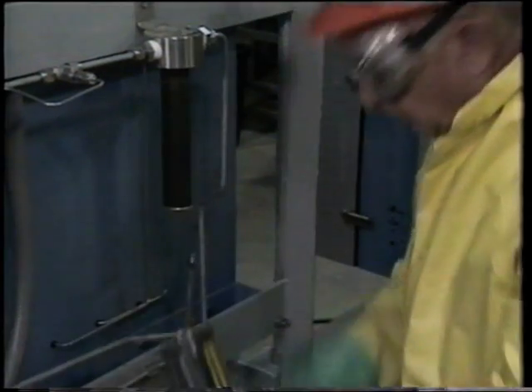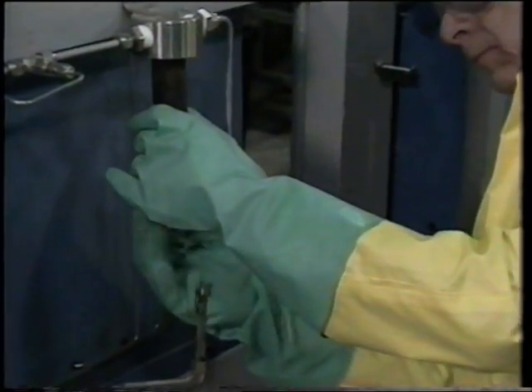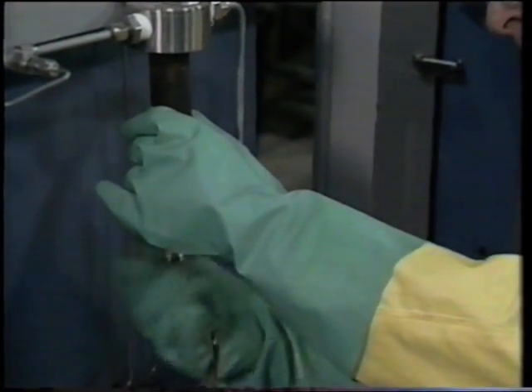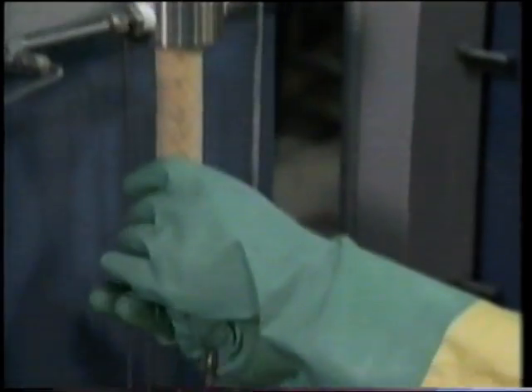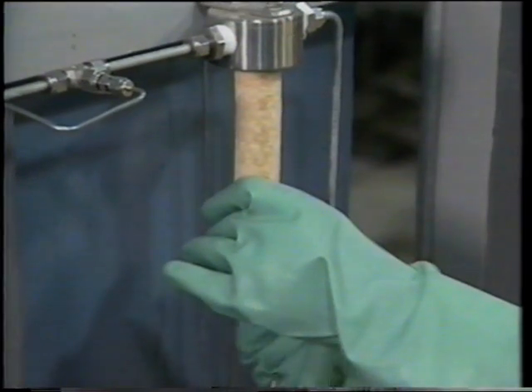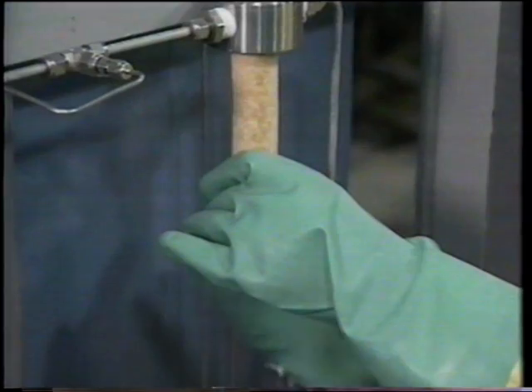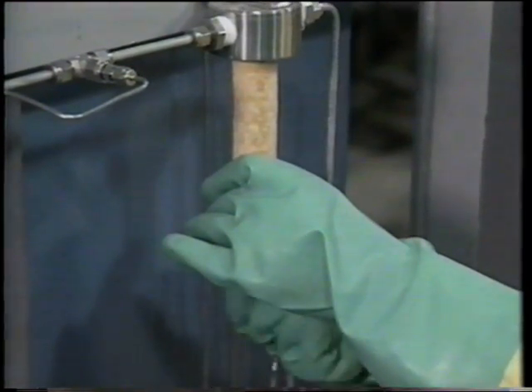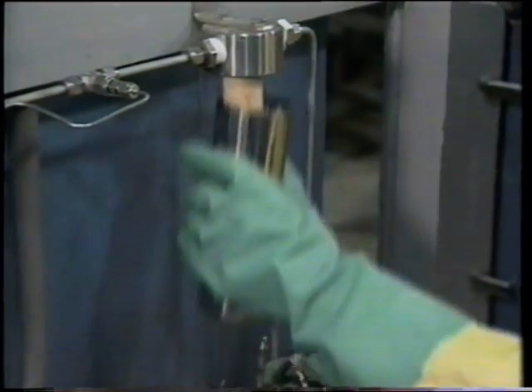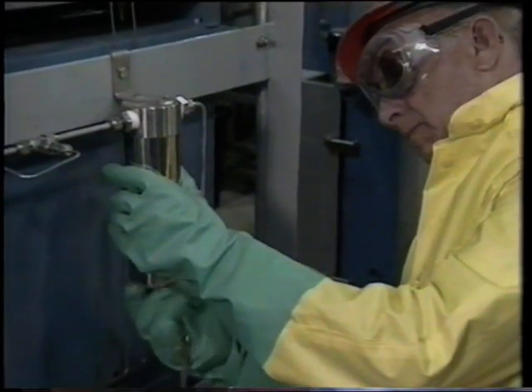To replace the filter, block and depressurize the system. In this example, it's necessary to remove the filter housing and filter retaining nut. Then replace the filter element. Reinstall the filter housing and return the system to normal operating conditions. If conditions do not return to normal, the problem may be with the sample tap or probe. Your workbook has more details on how to correct these problems.